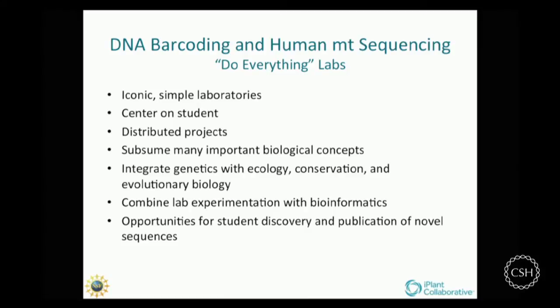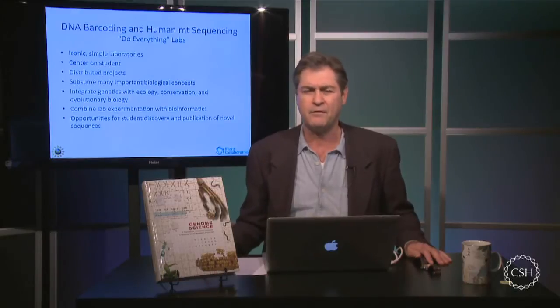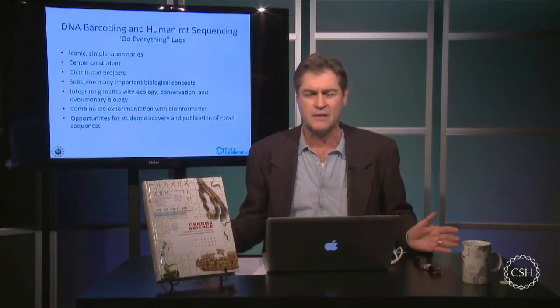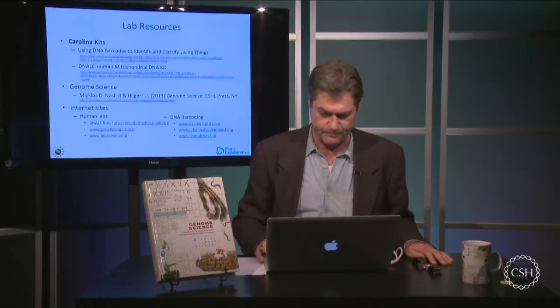And importantly, it combines in vitro or wet experimentation in biochemistry with in silico or computer bioinformatics on your computer. And as I'll show you, gives the opportunity for novel, relatively simple but novel publications by students, especially publication of novel sequences to GenBank.